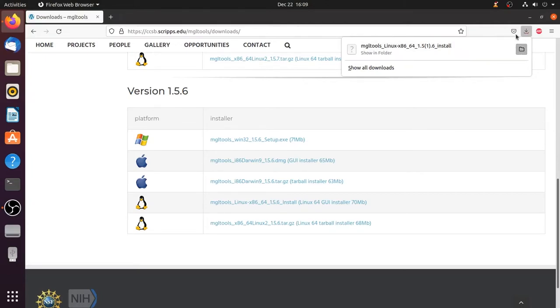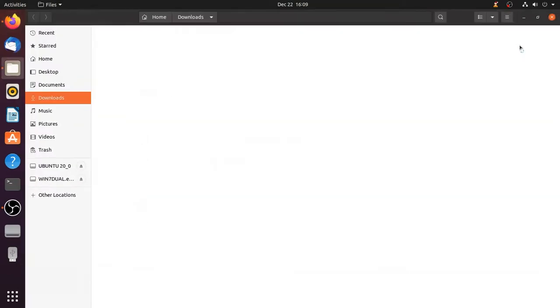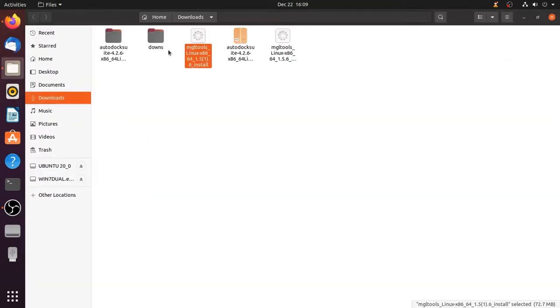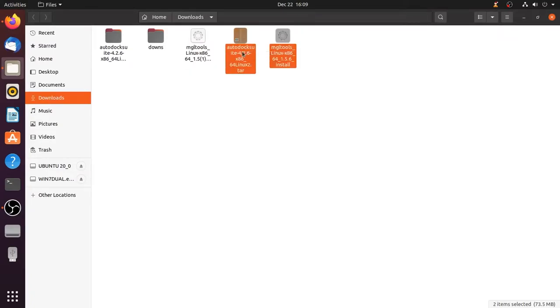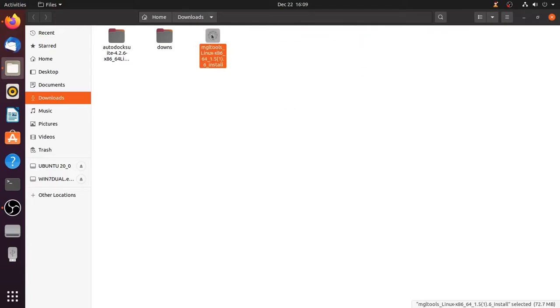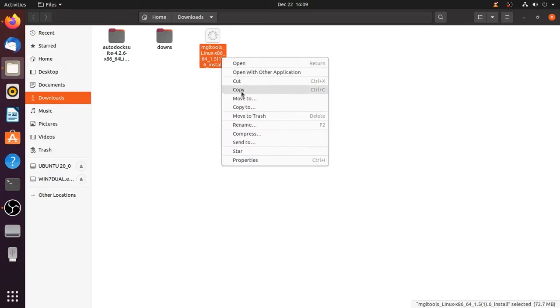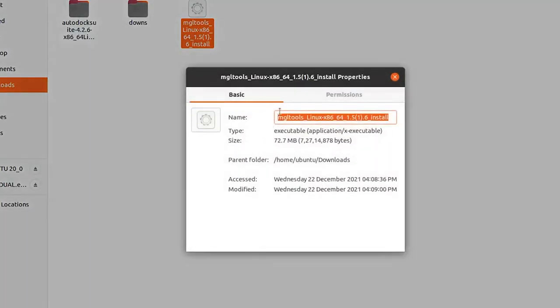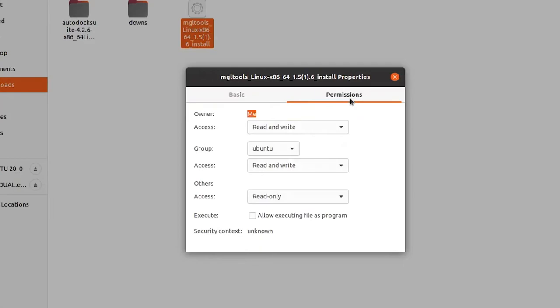Open the folder after downloading is completed. First thing you have to do is right click on the file and go to properties. There will be two tabs, basic and permissions. Go to permissions tab and check the box allow executing file as program and then close the dialog box.